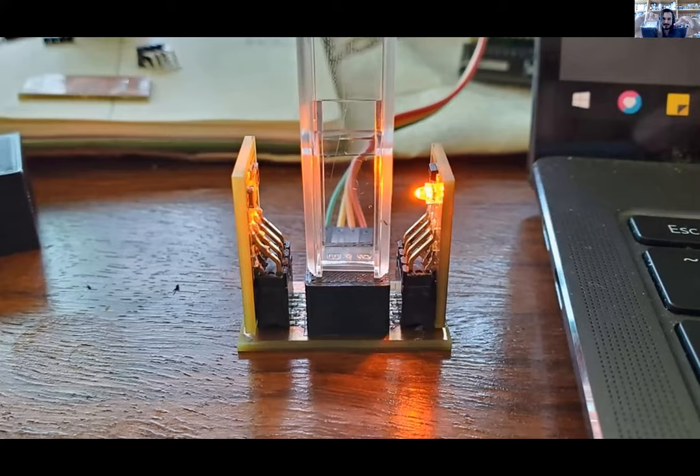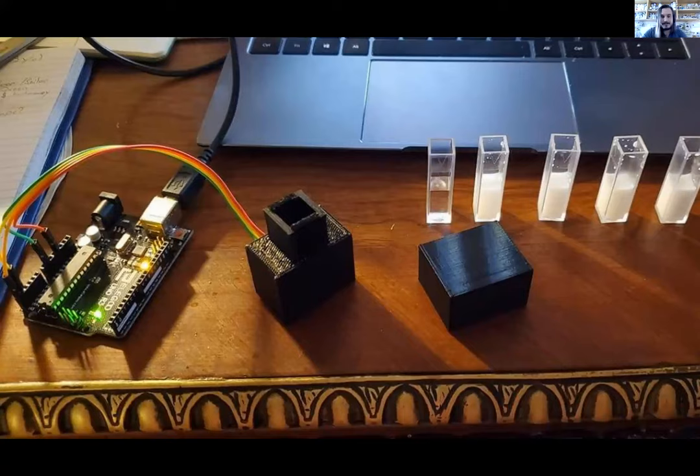I was even thinking of having these weird wheels of different sensors and different lights that you can turn. And so it's like dial a color, essentially. So it's like a poor man's spectrophotometer, but it's enough, and you can actually do good data, good research with it. And so I did some testing.